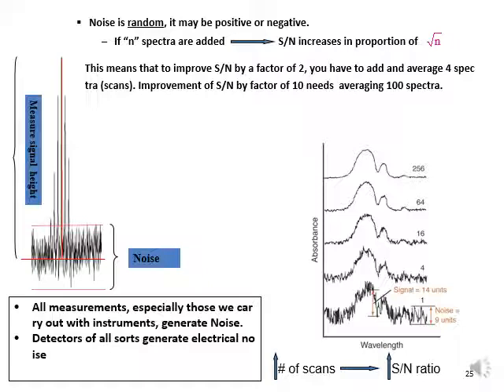After 4 scans, you can see that the signal is going smooth. And when you increase the number of scans, you can see the peak very clearly.